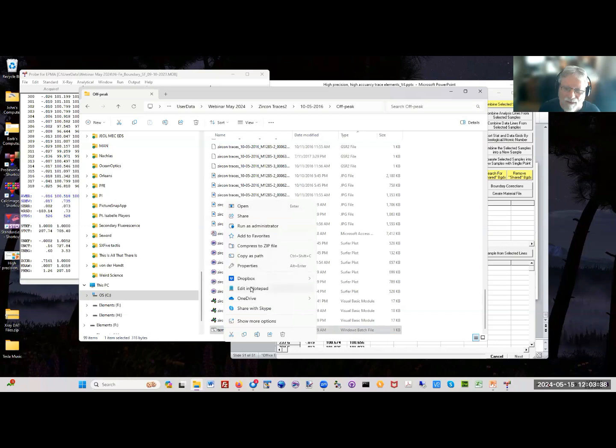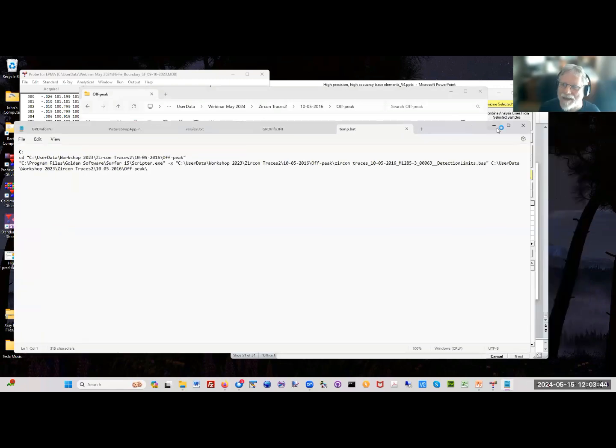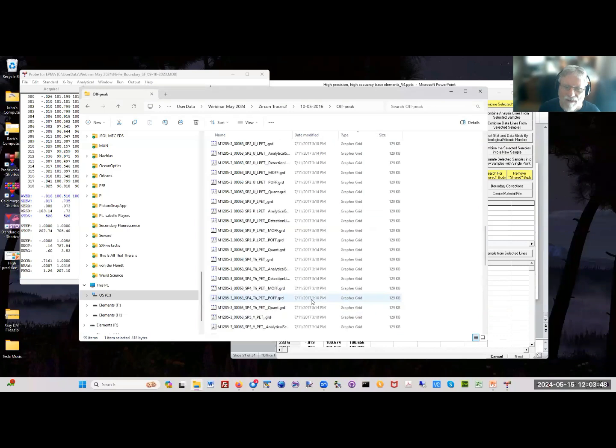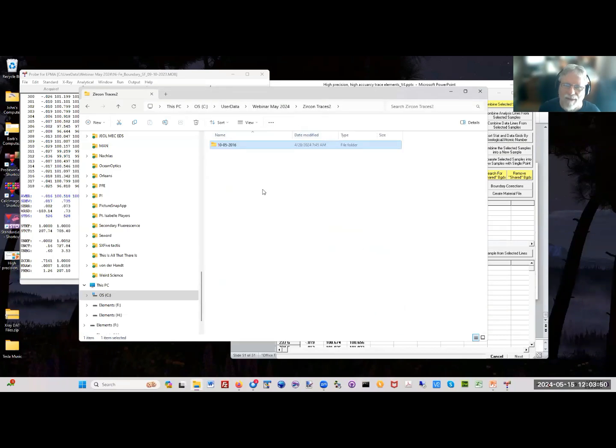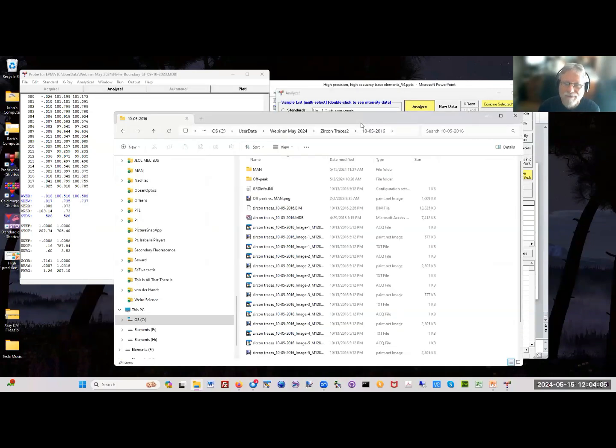Maybe we can have a webinar at one point about all the batch versions. It's documented on the forum, I know that, but it creates a batch file. I'm not finding it here, but I think it's because I only ran one. When you open up your first project, it creates a new file, and only when you do the second, third and fourth projects does it add lines to that. But yeah, that's a feature. But you can also just run them in parallel. It doesn't hurt.